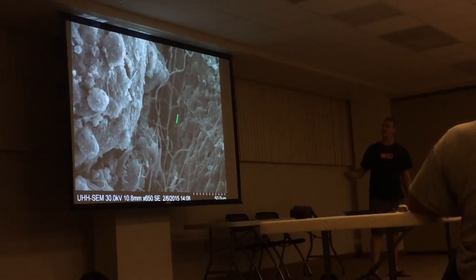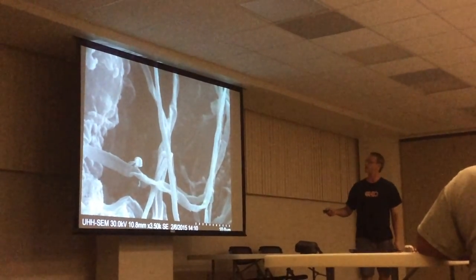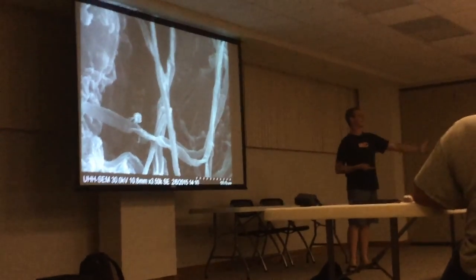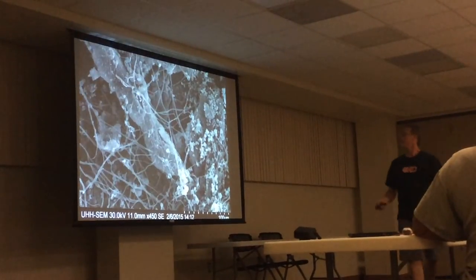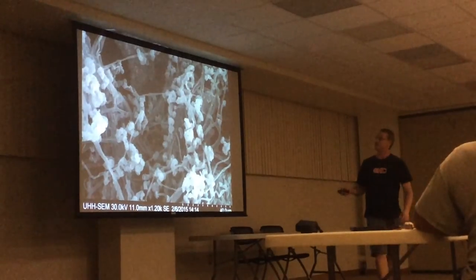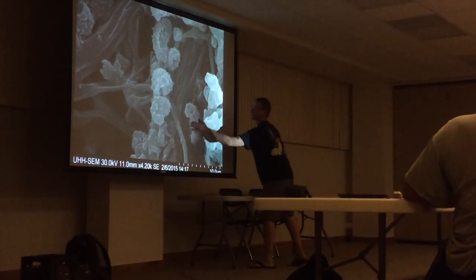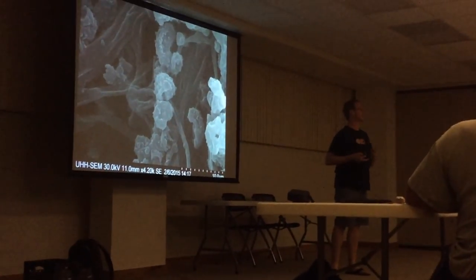Some plant material and hyphae on the inside. Anybody see the bacteria right there? Tiny little bacteria - little car on the highway. They use these hyphae to get around; if they're mobile, they use a water layer with an enzyme to allow them to scoot around, and they use these as highways. Hyphae mixed in with that bacteria that looks like the parent material - they almost look like sea slugs. Tiny little sea slugs with the same contoured bumps on the back. If you start looking at them and watching them, they start to have the same patterns and you can start identifying them.